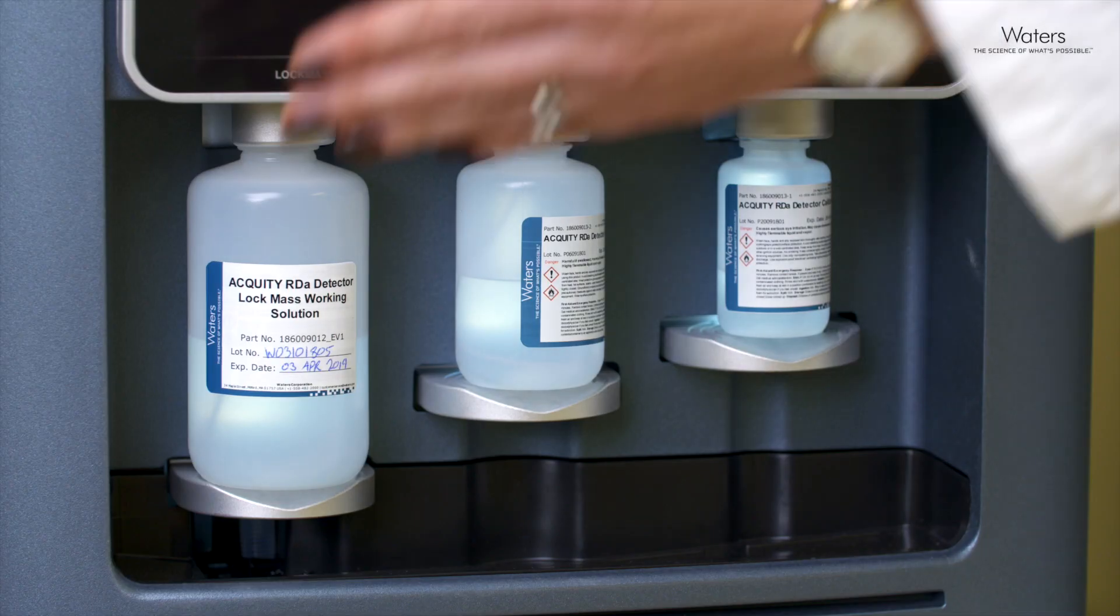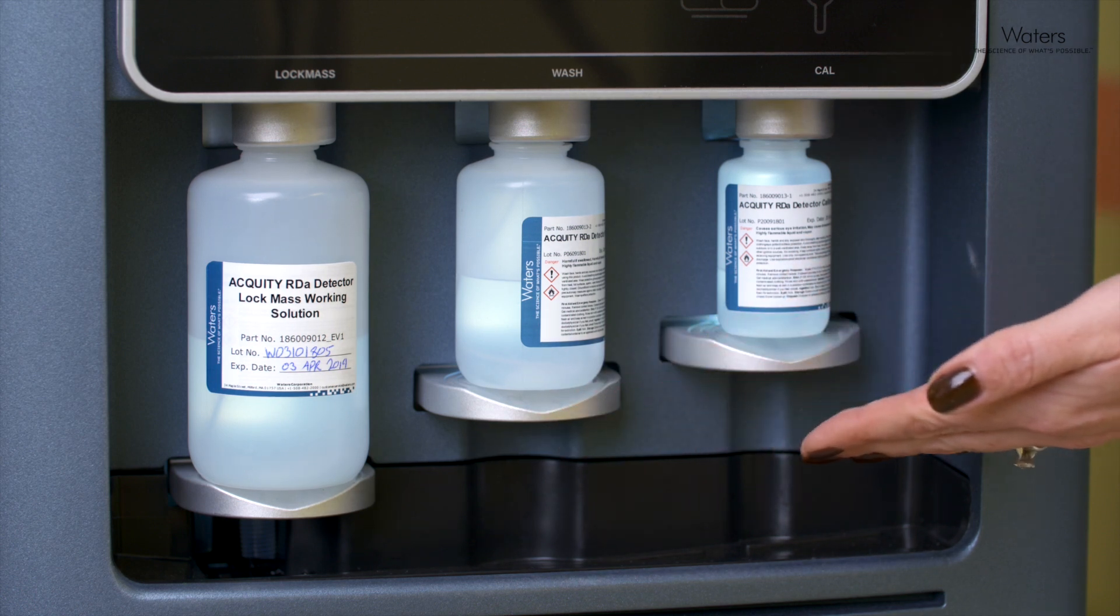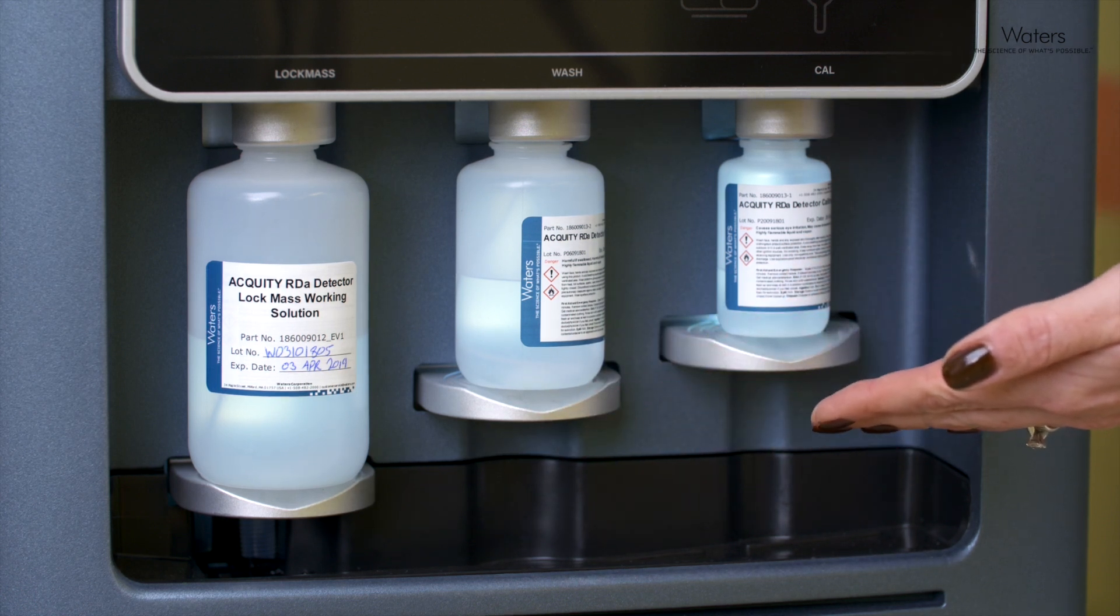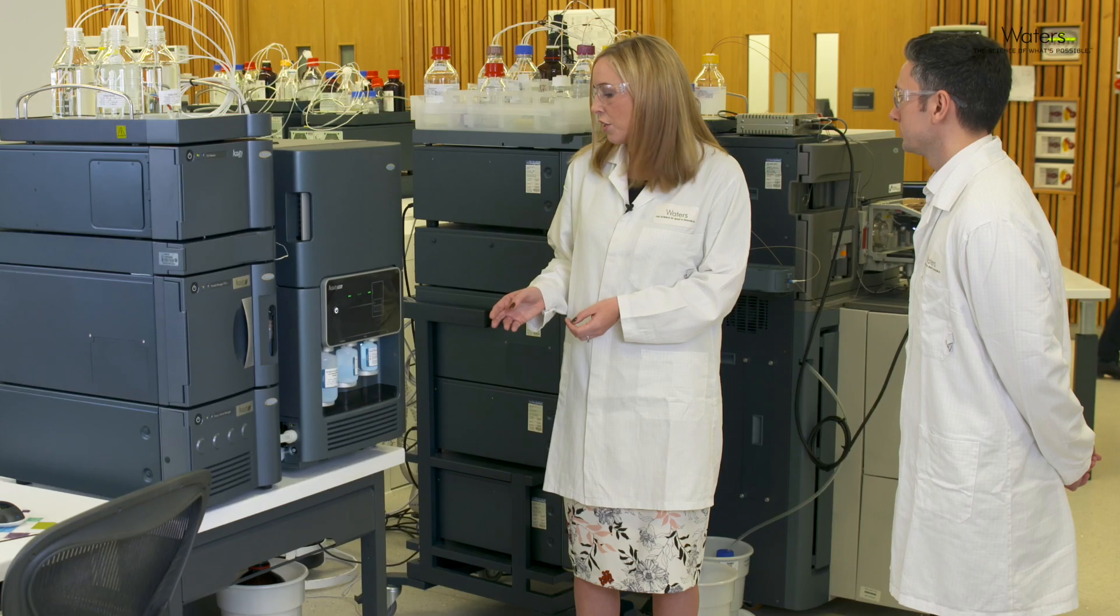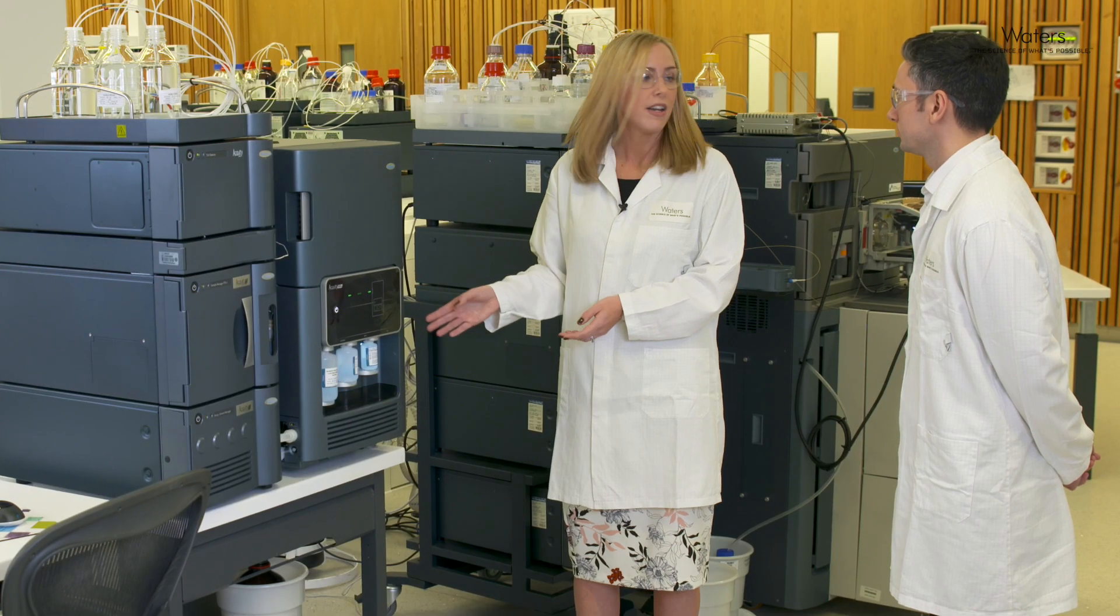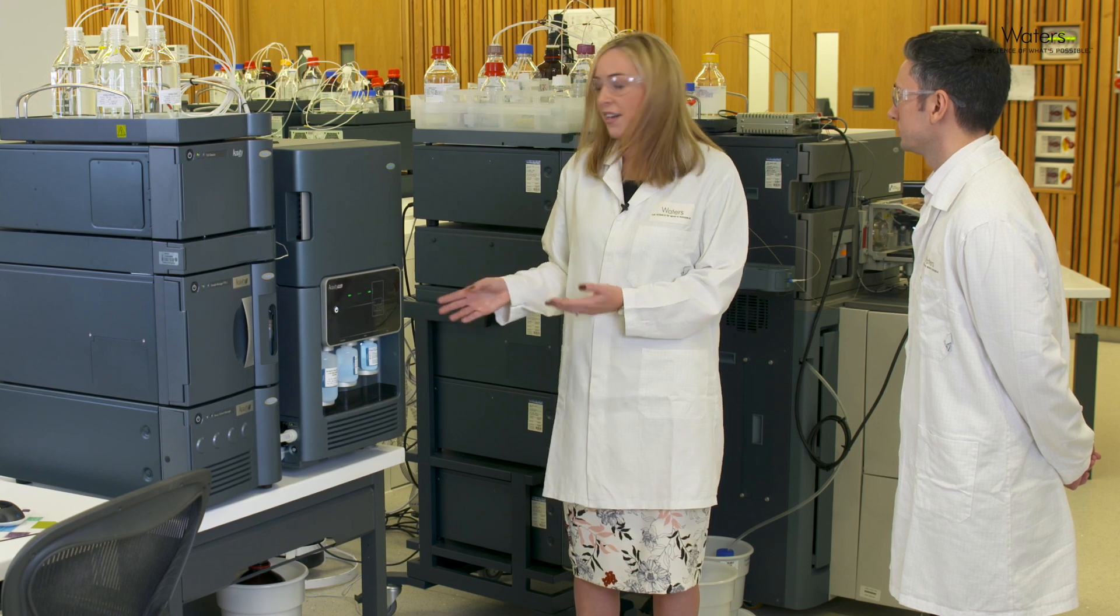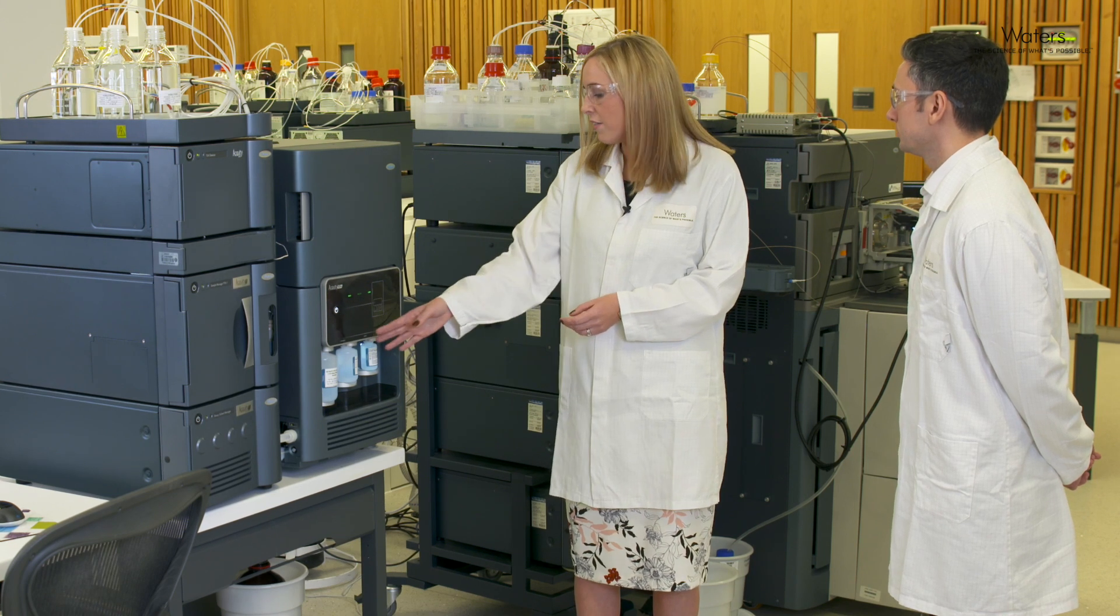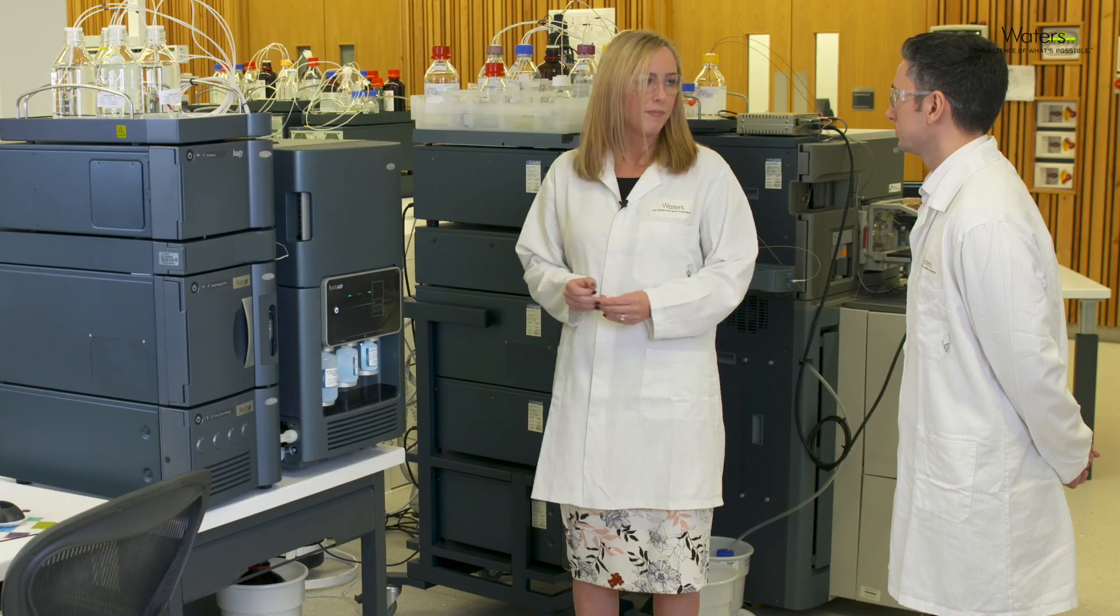The fluidics bottles here can be made up using kits that you can buy directly on the Waters website along with any standards or columns, and they're very easy to prepare.